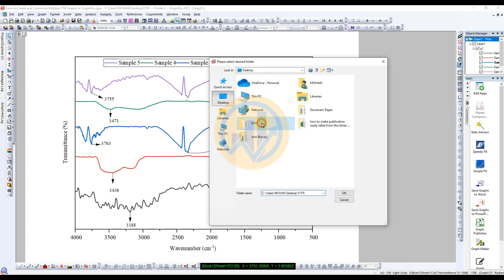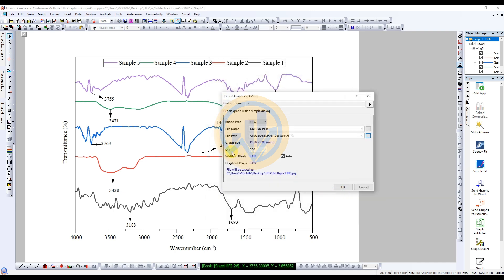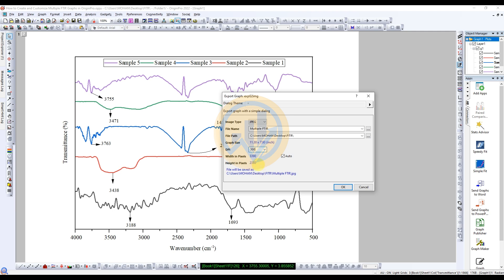Select a particular folder, then click OK. One important setting in this step is the DPI — the resolution of the graph. The lowest is 100 DPI. Change it to above 300 DPI for quality output. 300 DPI is quality, 600 is higher quality, 900 is high quality, and 1200 is very high quality.